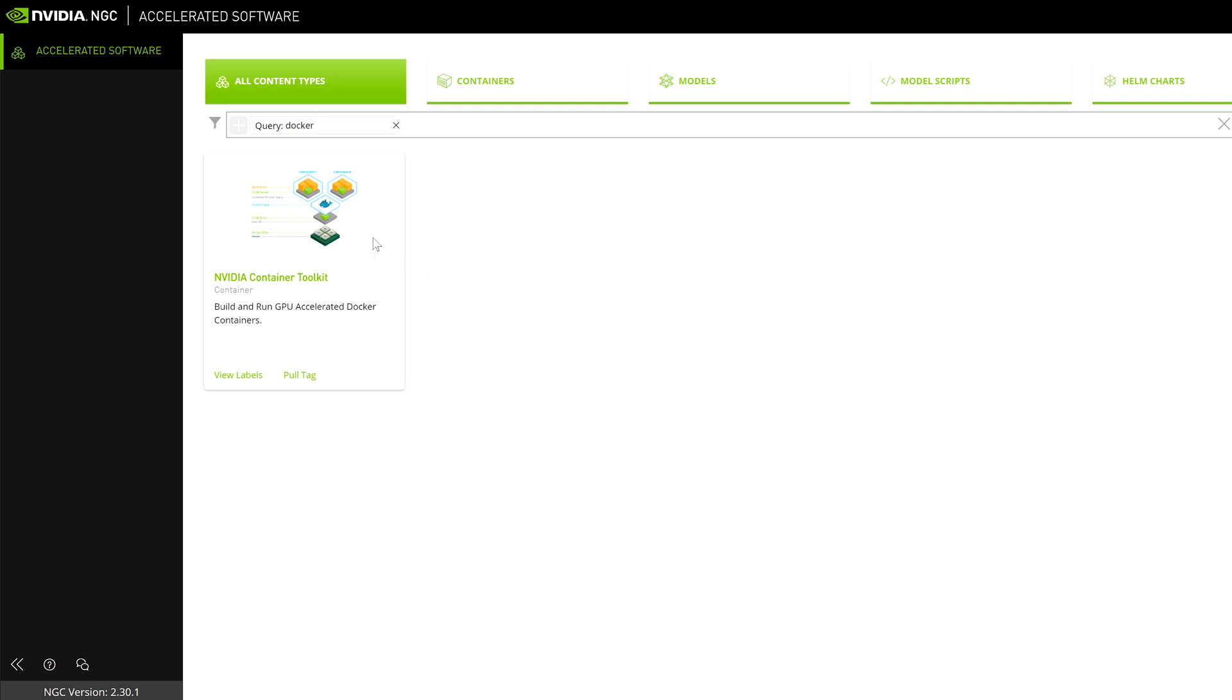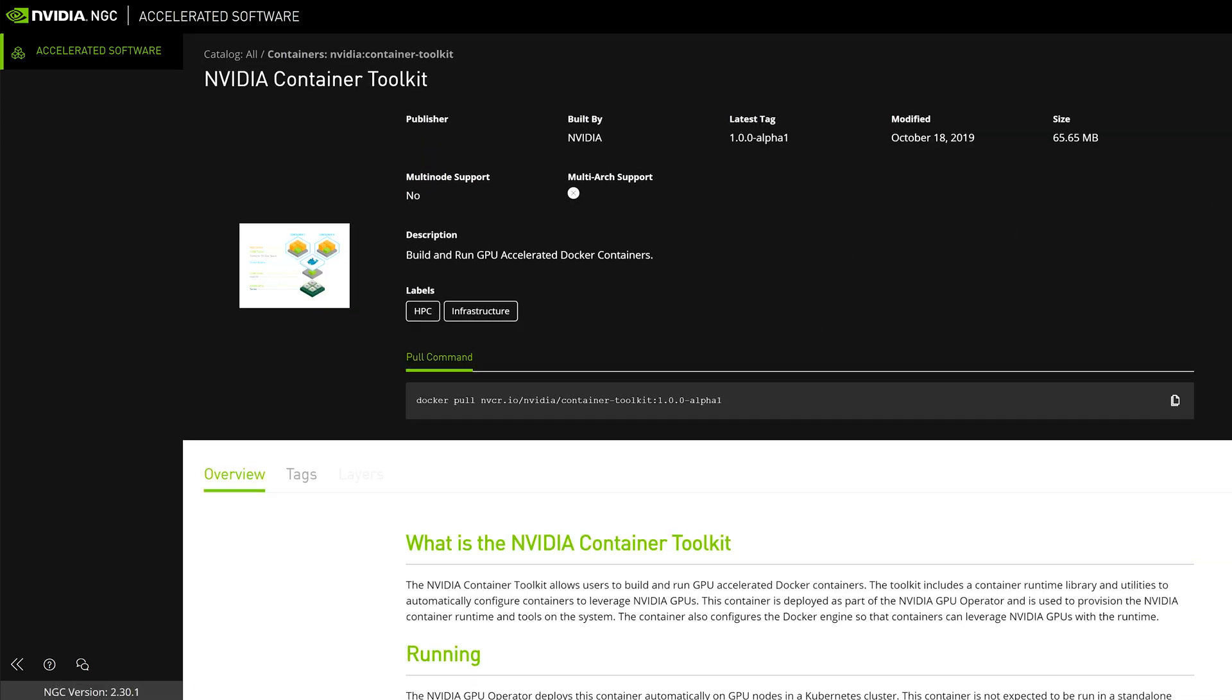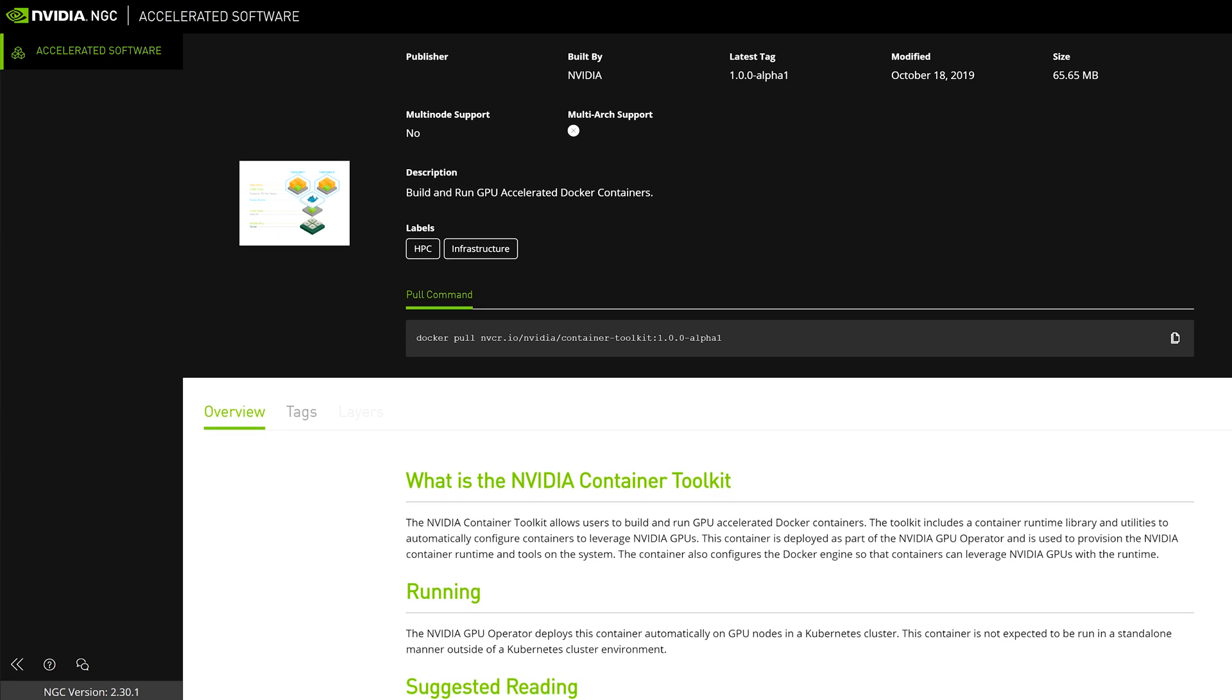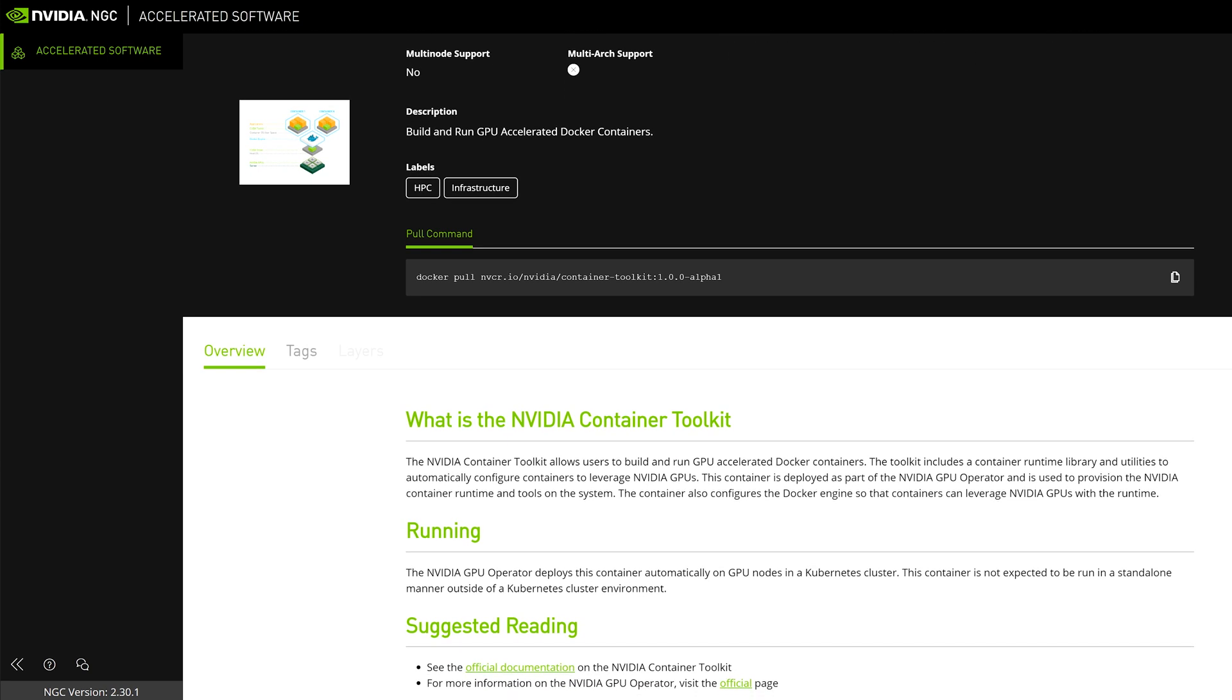For this example, we have NVIDIA Docker 2 already installed on our system. If you don't have it yet, please pause the video to install it now. All installation requirements can be found at ngc.nvidia.com.